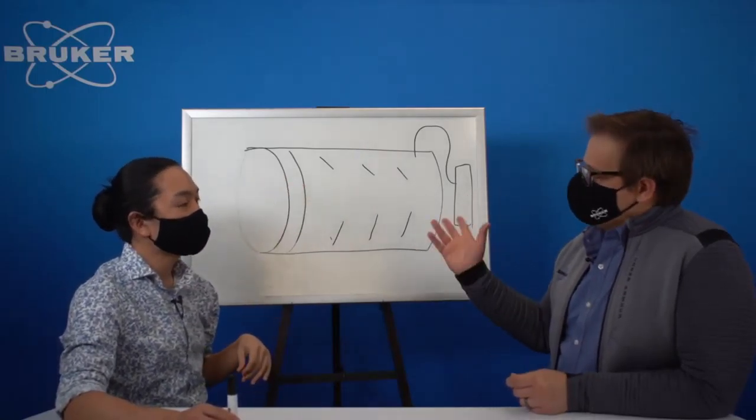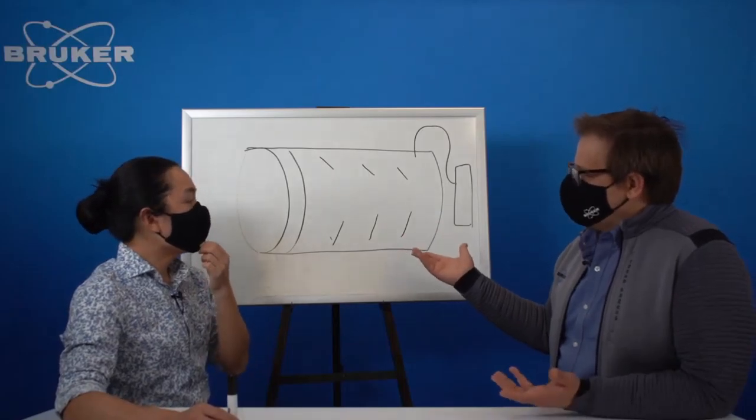So now what if you had a sample that was fluorescing? What could you do about it?